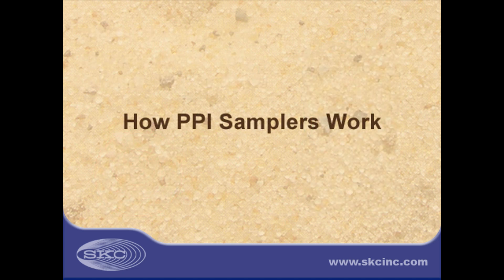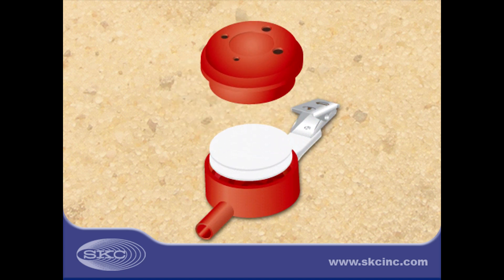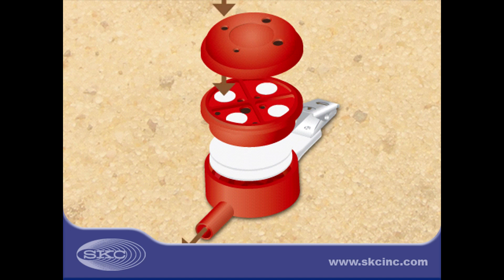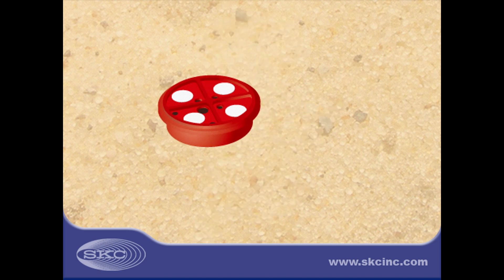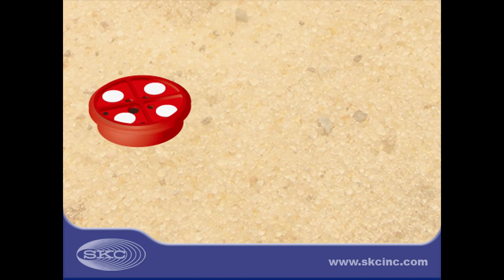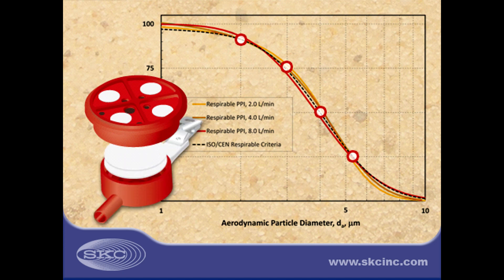So how do PPI samplers work? The disposable PPI looks like a traditional 37 mm filter cassette, but is different. The PPI inlet section comprises 4 size-selective impactors with pre-oiled impactor plates to scrub out and retain larger, non-respirable particles. Each impactor has a 50% cut point that corresponds to a specific location along the ISO-SEN curve. Respirable dust collects on a 37 mm collection filter in the outlet section for analysis.